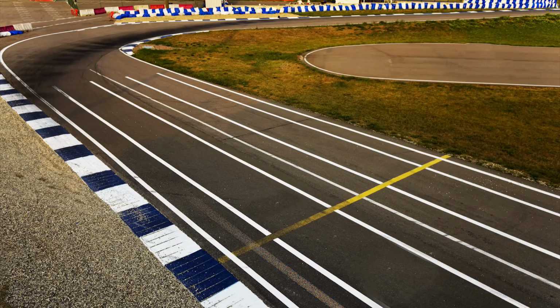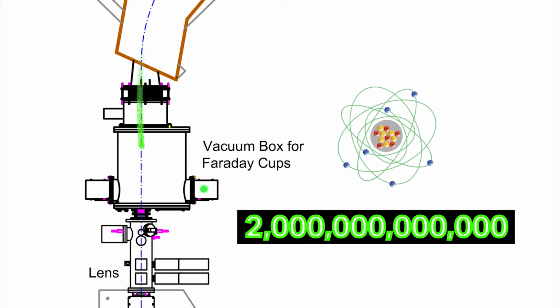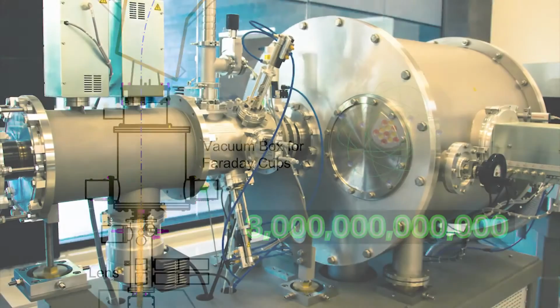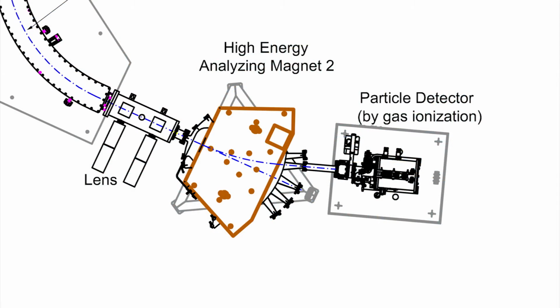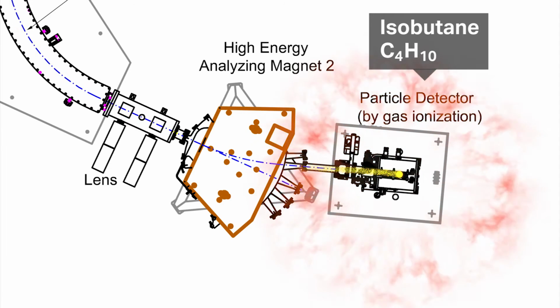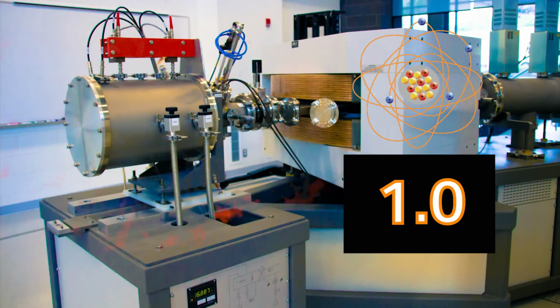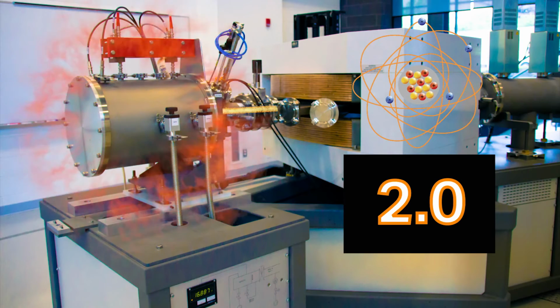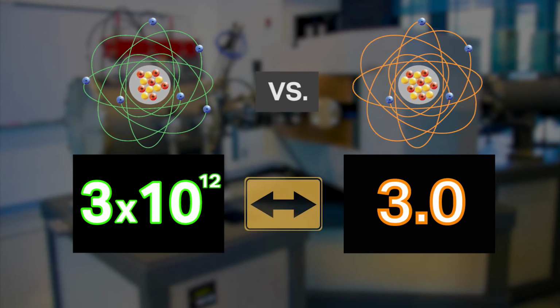So now we're going to measure the strength of the carbon-12 and carbon-13 beams. But carbon-14 is a very weak beam, and we can't measure its strength with current. We have to actually count the atoms of carbon in that beam. So at the very end, we have a detector filled with a gas, isobutane, and the carbon-14 atoms come down and collide with the isobutane, and they give off their energy. This is a high-speed collision. All that energy is dissipated, and each time there's a collision, we measure that energy. So now we come up with a count, and the number of carbon-14 atoms is compared to the carbon-12 that we measured, and that tells us the concentration.